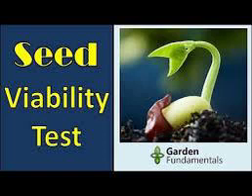Accelerated aging test, AAT. The test was developed by the seed testing lab, Mississippi State University, USA, for determining the storage potential of seed lots. Principle: the aging process is accelerated by subjecting seeds to high temperature, 40 to 45 degrees Celsius, and high relative humidity greater than 90%. Seed lots which show high germination in AAT are vigorous and expected to maintain high viability and be good in storage. 100 seeds in 4 replications are wrapped in a fine muslin cloth.